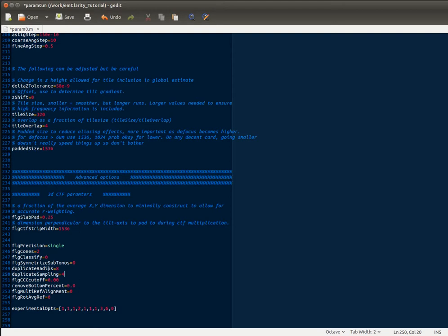The CCC cutoff, if you apply a value here, will give you a cutoff that's applied to the averaging and alignment. So it'll ignore volumes but not delete them below a given cross-correlation coefficient. Remove bottom percent, as it sounds—in this case, it doesn't just ignore those volumes, but it actually takes them out of consideration. So if you say ignore 0.5, it'll cut out the lowest 50% of your scoring volumes. I'd recommend not using this. There is a parameter that's in these advanced options down here that automatically downweights the contribution of lower scoring volumes. Rather than deleting them, you can just still retain the low resolution signal from these, and that's generally the better way to go.